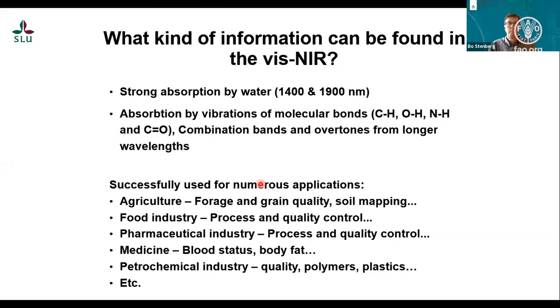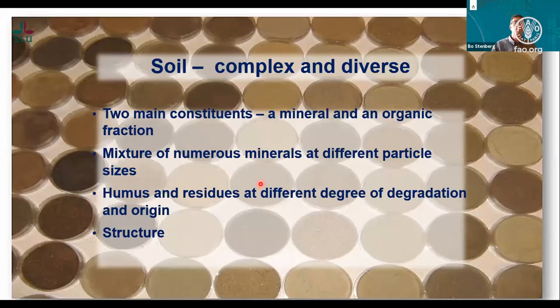Actually, it's quite little used commercially in soil, but it starts to show up in different labs and so on. So it has been there for a couple of years, but not as for forages and grain, because that's the main method used. At least in Sweden and large parts of Europe, that's the method used, and in the United States and Canada as well, and probably many other places that I don't know about. Okay, so just move over to soil.